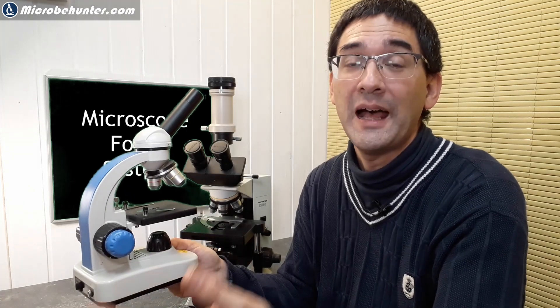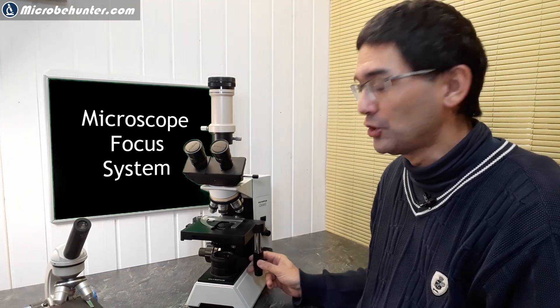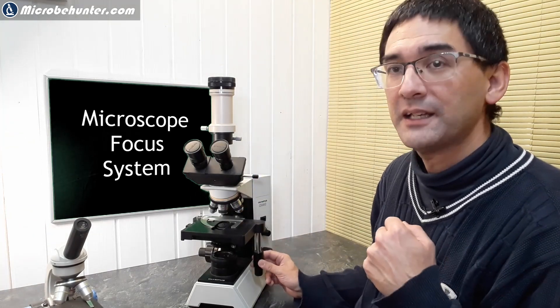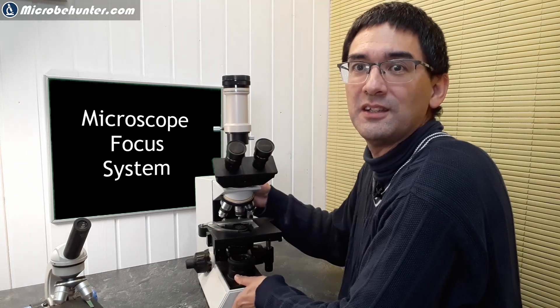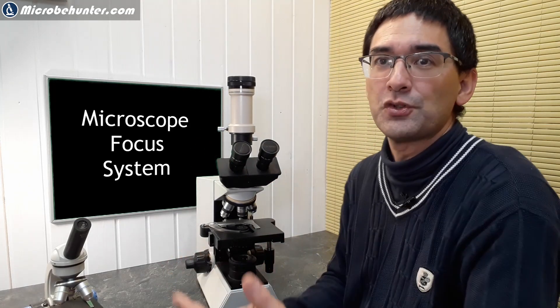You can really only use one hand to operate the focus anyway, because the other hand is generally used to operate the mechanical stage. For right-handed people, the mechanical stage is operated with the right hand, and with the left hand you operate the focus knob — which you can't see here, but that's basically how I use the microscope.